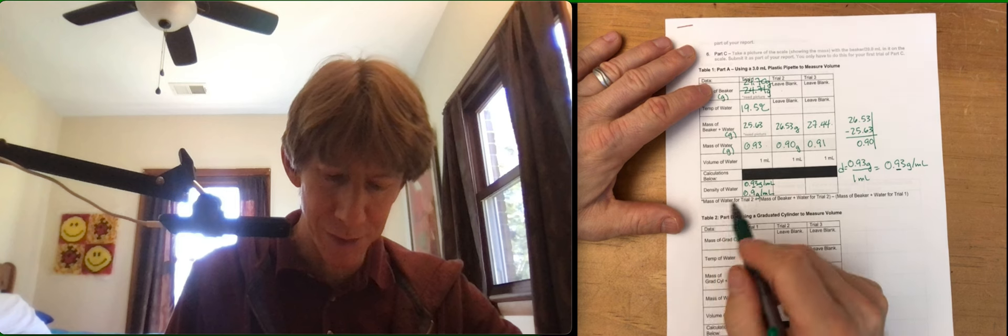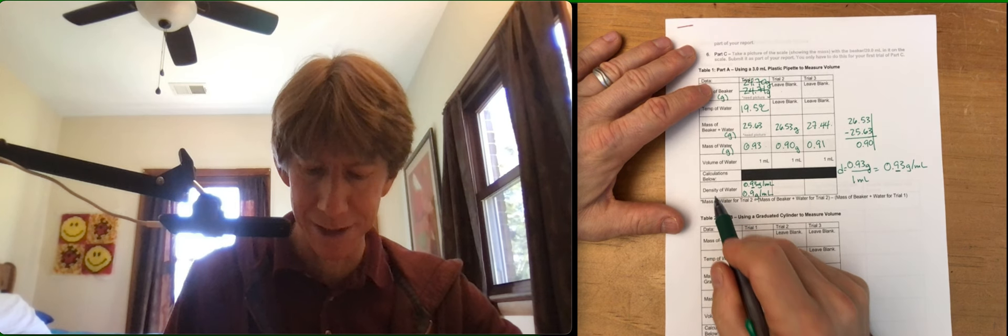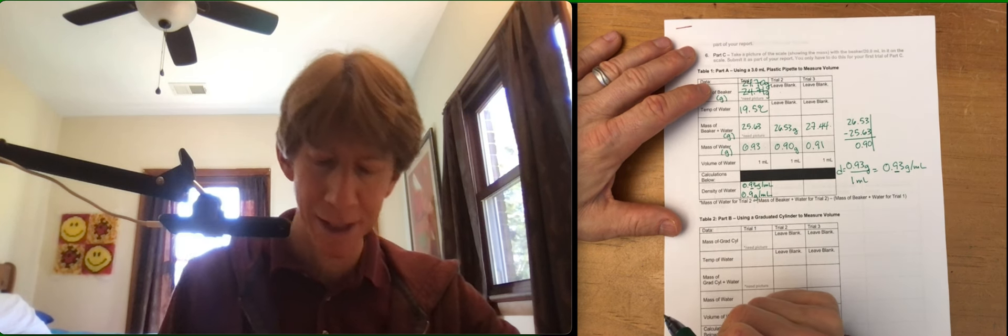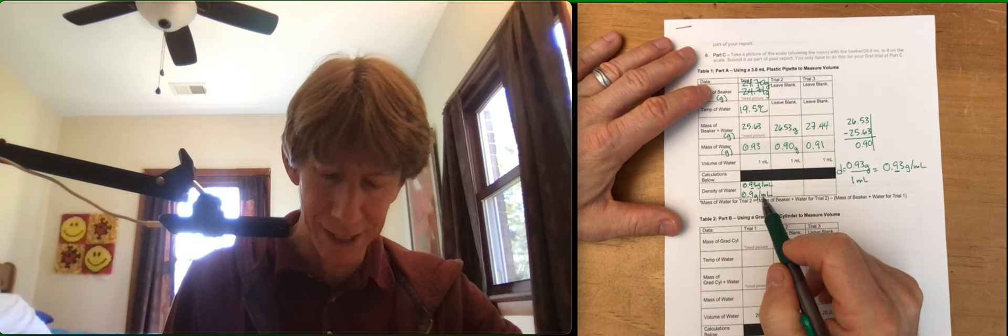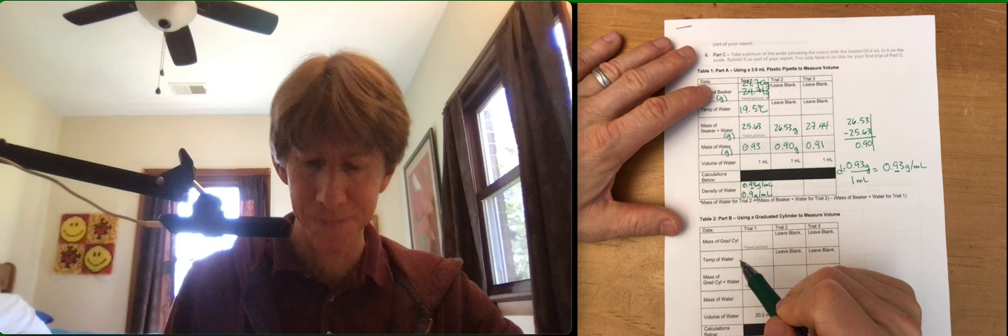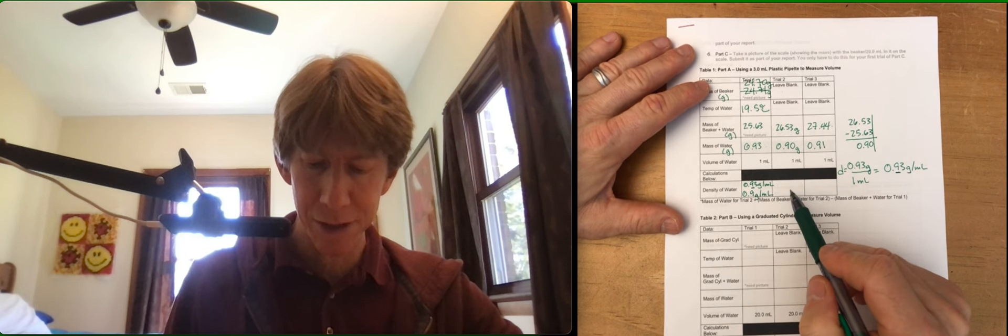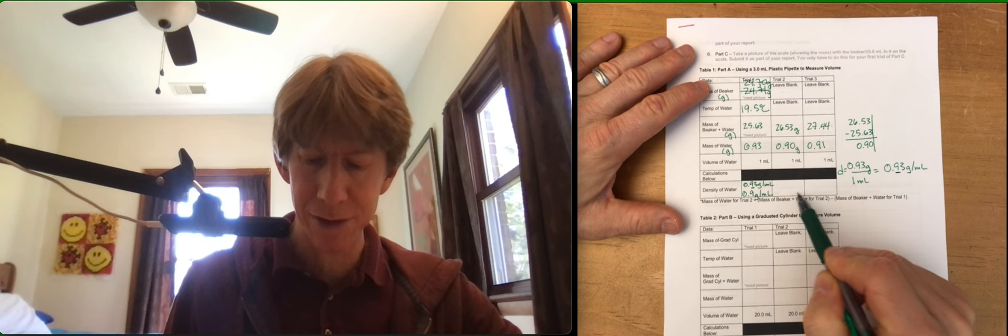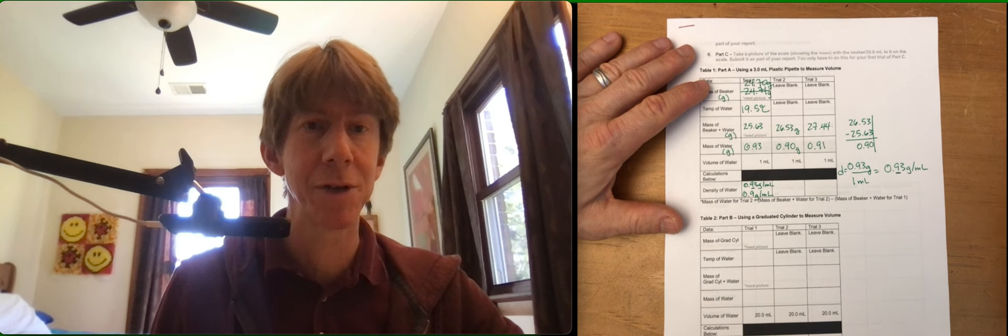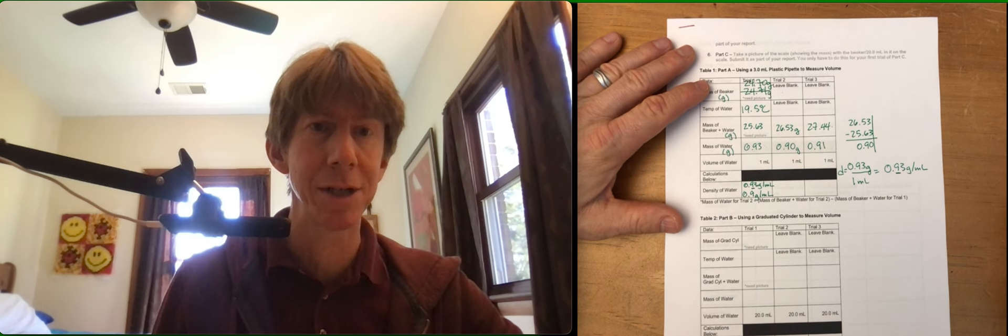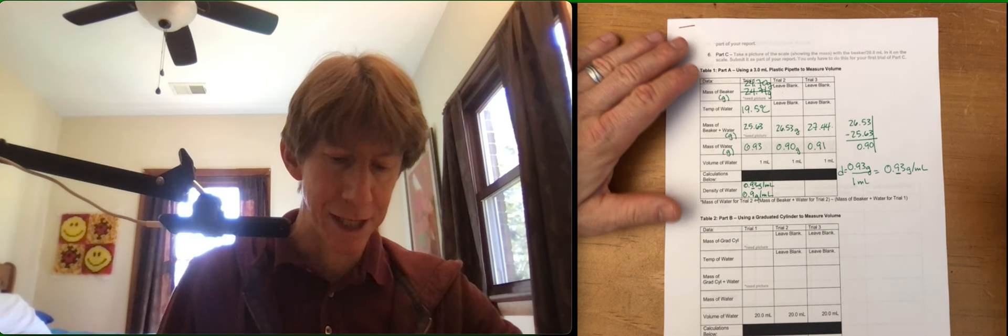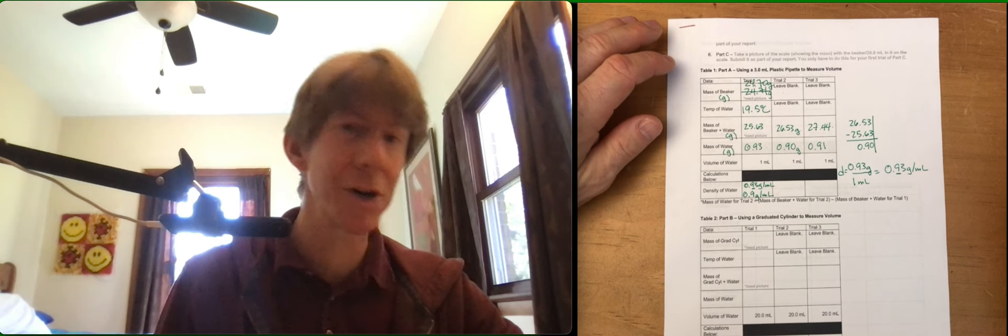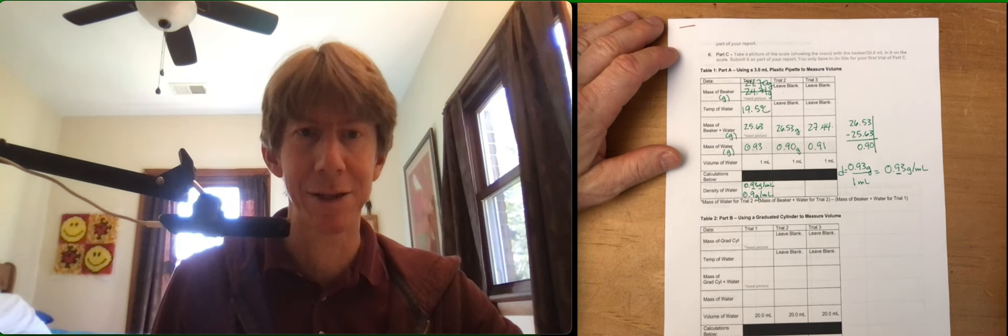And again, you could put the units on the box over here in parentheses if you wanted, but I didn't this time. So what I want you to do is I want you to do the math for these two, and otherwise we've gone through all of table one and procedure part A together.